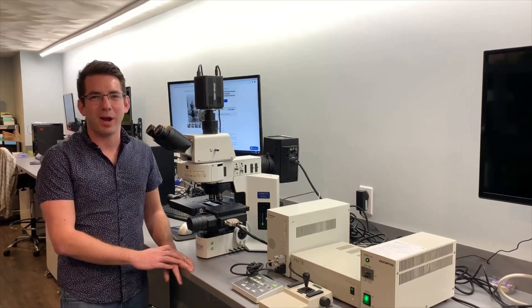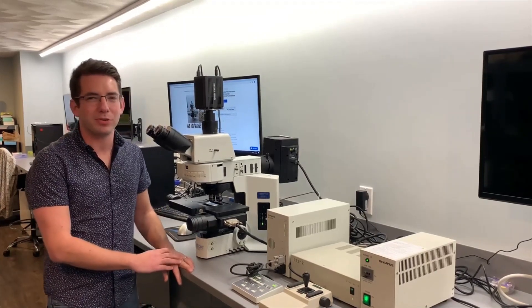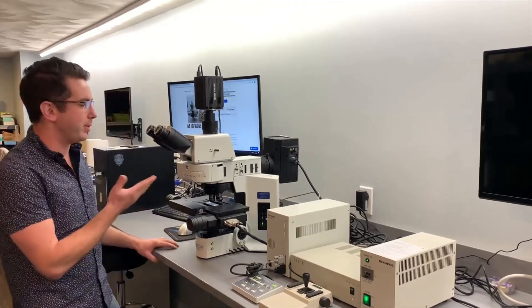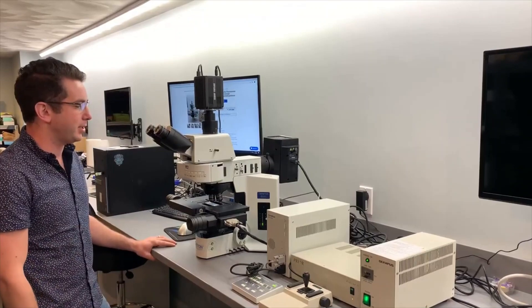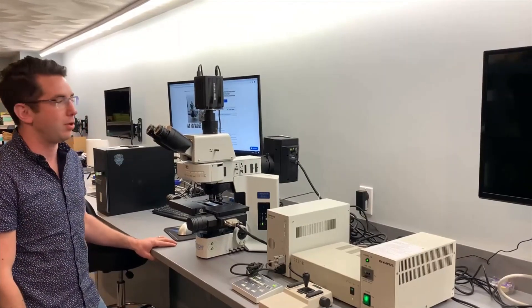Hi, this is Brian with Boston Microscopes. Today we're featuring our refurbished Olympus BX61 upright fluorescent microscope.